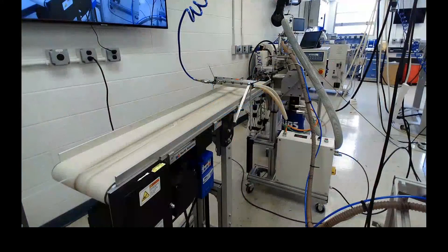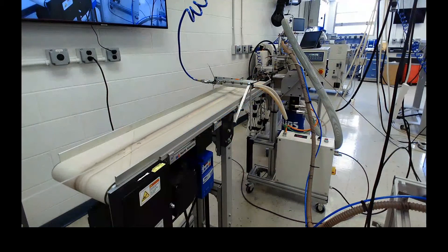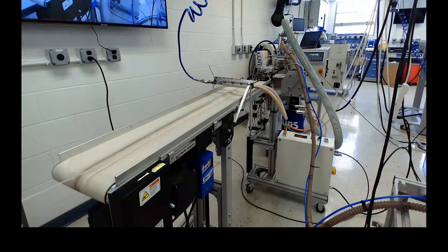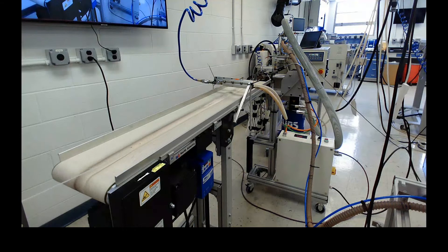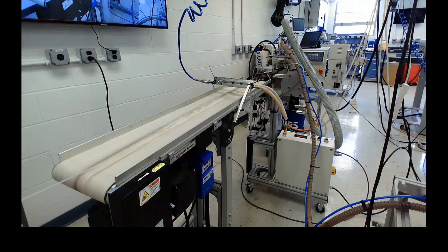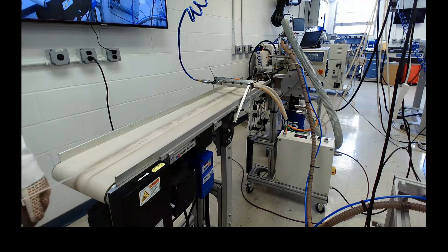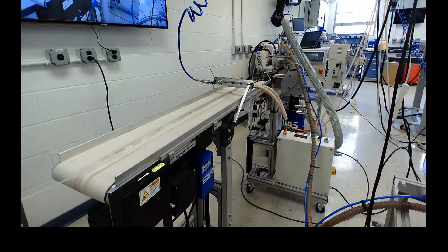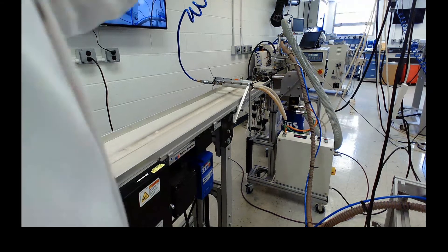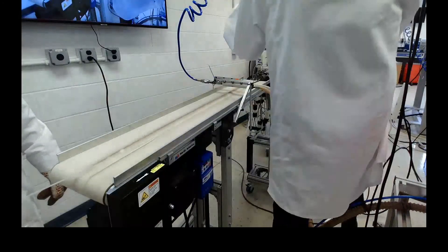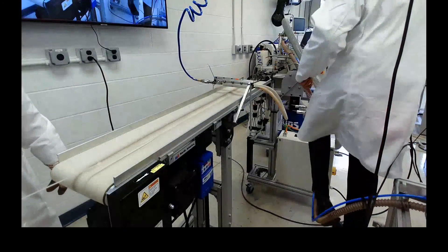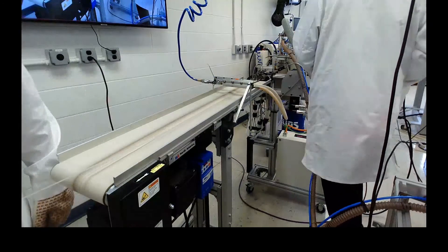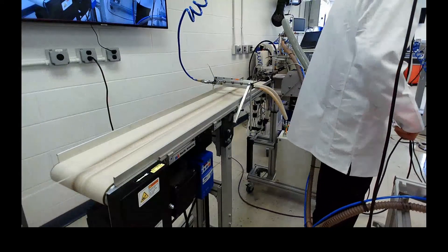So here with the second setup you see our single screw extruder that we currently have attached to our dedicated torque rheometer. This is in our case our largest drive with the full-fledged torque measurement capabilities.